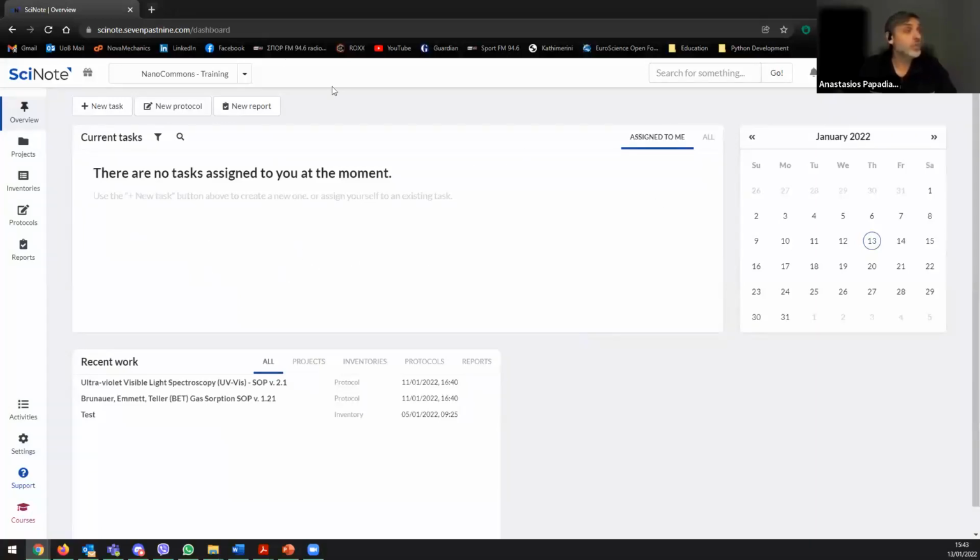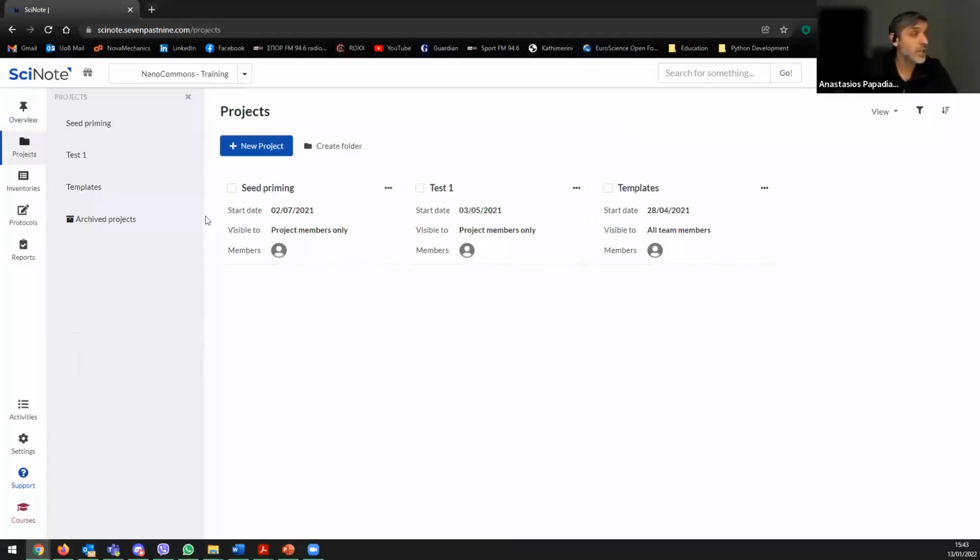So in the overview you can create new tasks, as we will see, new protocols and new reports. We will go through all this slowly. So the next thing that you have is projects. As we said, projects are, as their name says, a project.